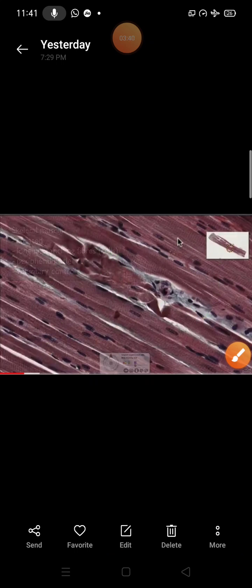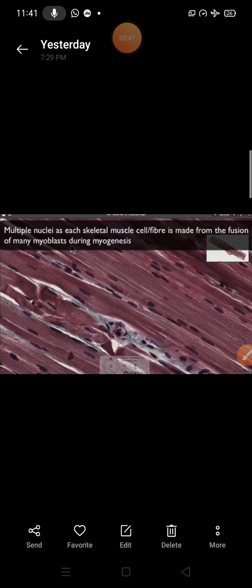This is the picture we can see under the microscope. As you see, multinucleated skeletal muscle cell fibers are made from the fusion of many myoblasts during myogenesis.